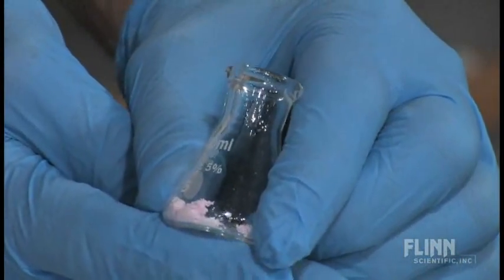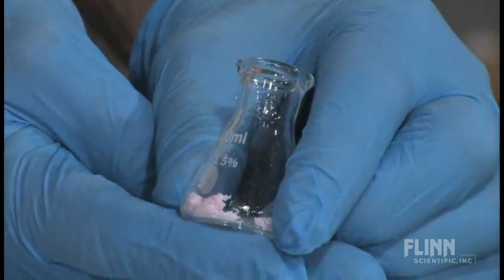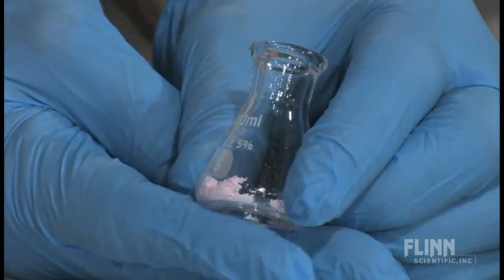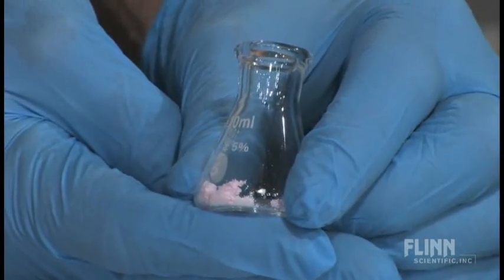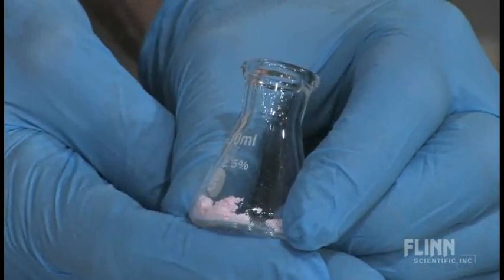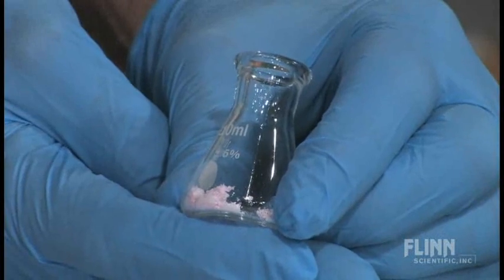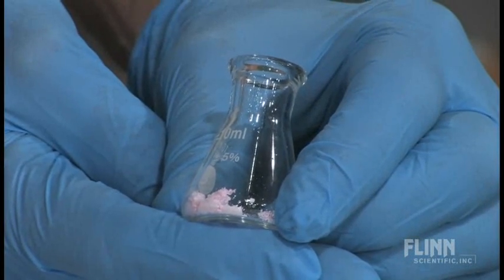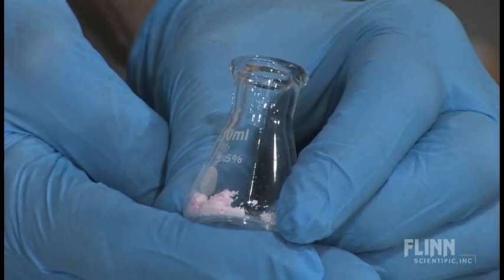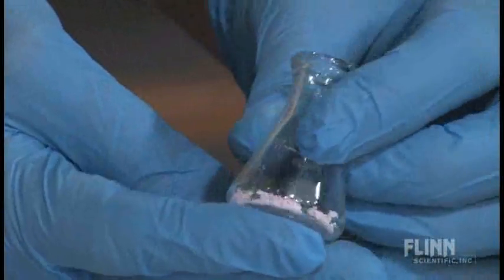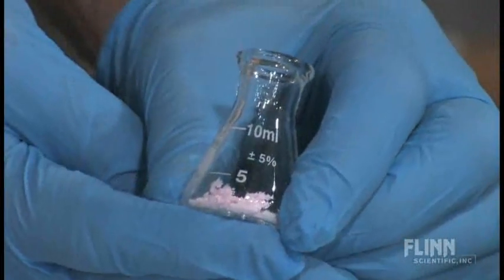Manganese 2 chloride that's anhydrous without water in it is a very, very light pink solid. Manganese 2 chloride dihydrate is a fairly bright pink solid.